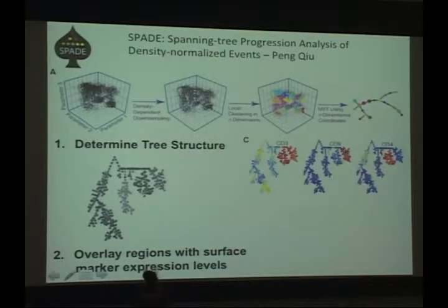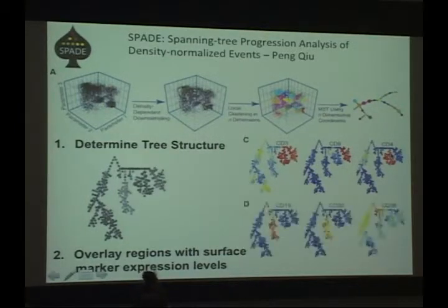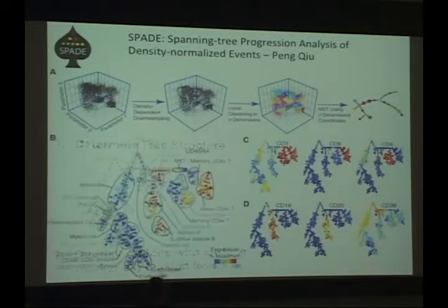Then we can say, well, what about CD8? You can see that one arm of that cluster is CD8 positive, one arm is CD4 positive. Same thing works for the other things. You get like a B cell arm that's indicated by CD19, and some of those are immature. They have only CD19 and no CD20. And then you can cluster on other things that are sort of distributed evenly, like CD38. They can help you define early progenitor cells and other similar populations.